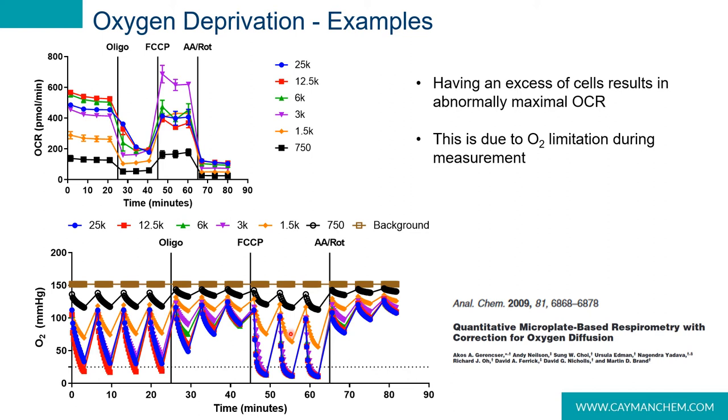Oxygen limitation is an important factor to be aware of when studying compounds that are designed to improve mitochondrial function. For example, if oxygen is limited following FCCP addition, a compound that mildly inhibits the electron transport chain may in fact yield data showing an increase in maximal oxygen consumption and spare capacity. This result would not be due to actual improvements in oxygen consumption rate, but rather the opposite — since the electron transport chain is not consuming all of the oxygen in the chamber, the rate of reaction is linear throughout the measurement window, resulting in artifactually high readings.